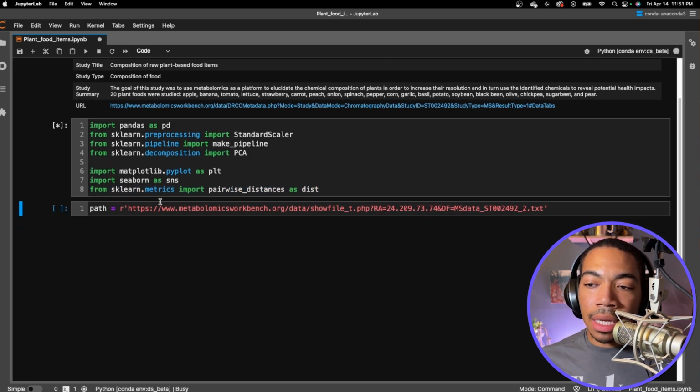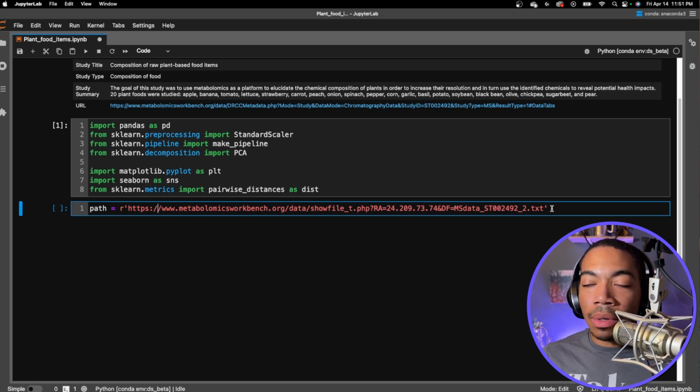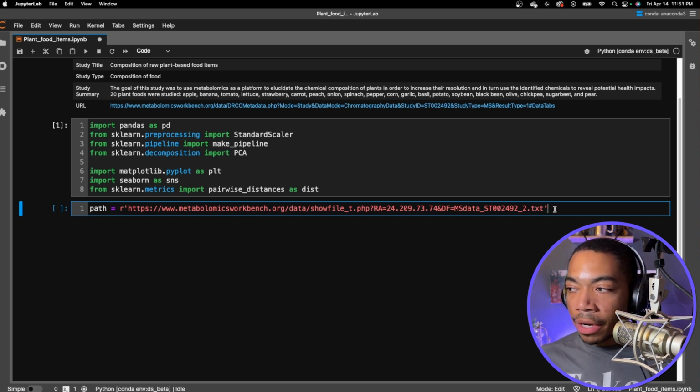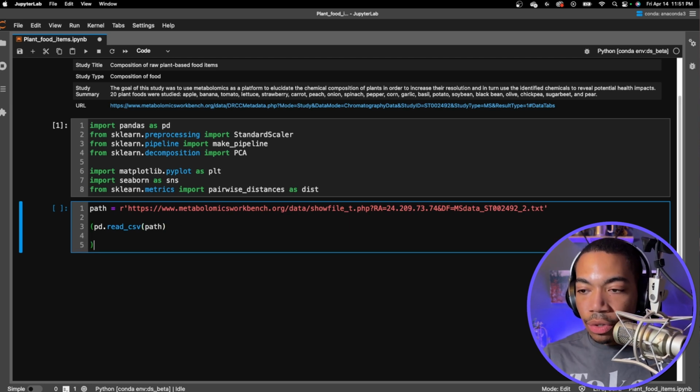Next, we will access that data file using this path. So instead of locating the data on our computer, we will have pandas locate the data on the internet, scrape that down, and then store it locally in our memory as a data frame. To do that, let's do this as we always do, using pandas.read, in this case read_csv. And let's just begin with the path, and we will begin cleaning this up as we understand the data structure a little bit more.